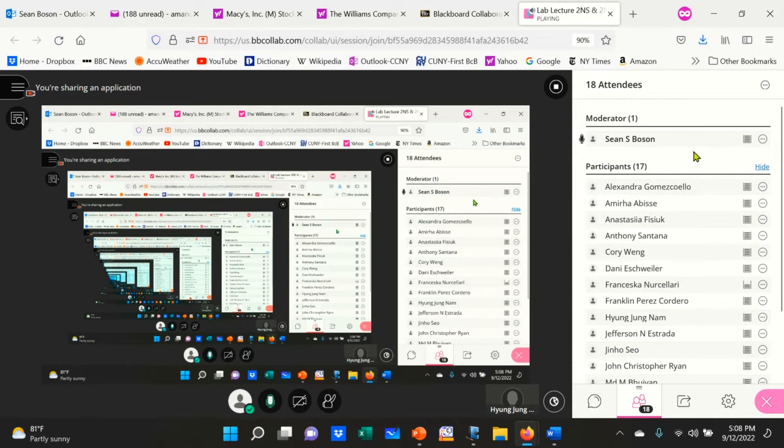all the points, all the small details, to figure it out, and then you come up with multiple choices, multiple possibilities, and then you narrow down slowly, one by one, based on the different aspects of NMR we are going to be discussing even in this short time. So the whole process is meant to be lengthy, and you have to be patient and diligent and do the analysis slowly, step by step.